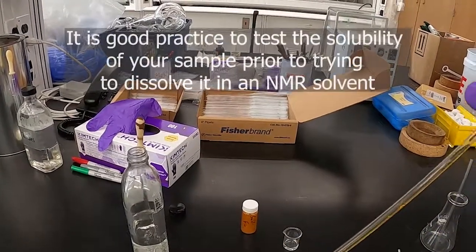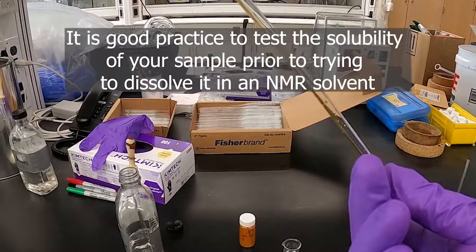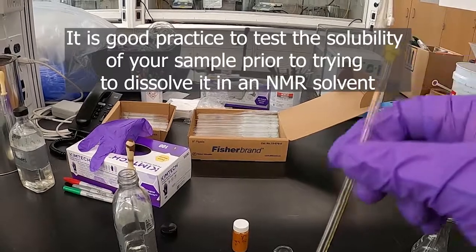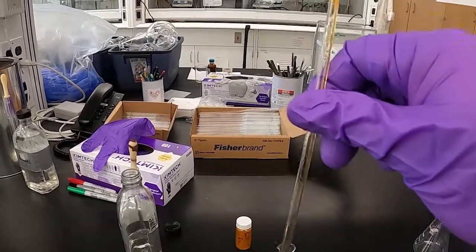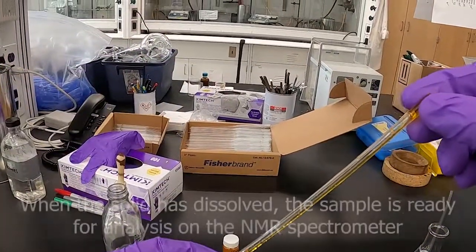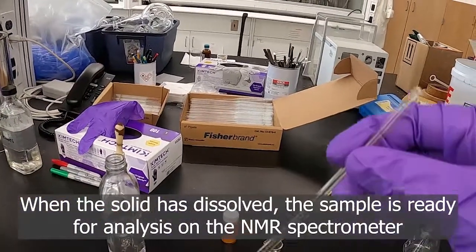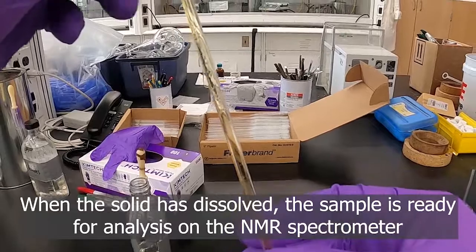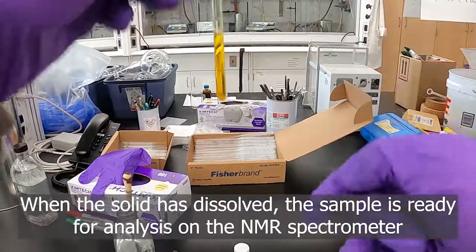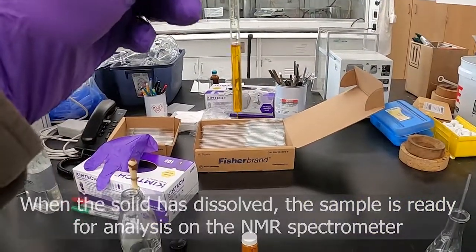That's why it's also a good idea to test in advance the compound you're putting in your solvent, to make sure that it's soluble in the NMR solvent you're going to be using. Sometimes just inverting the tube back and forth is enough to get your compound to dissolve. You can also tap it to get pieces to go down and get the liquid to drip down.